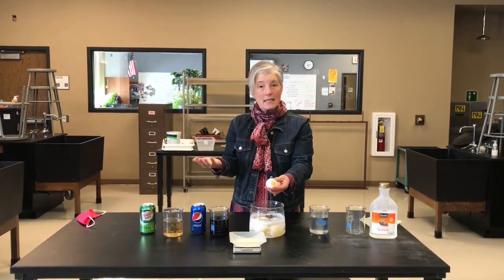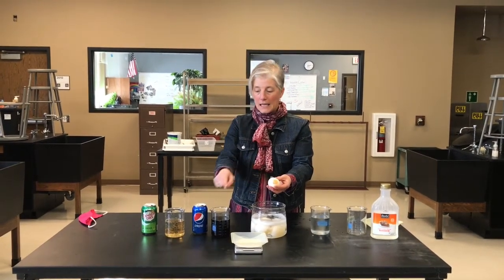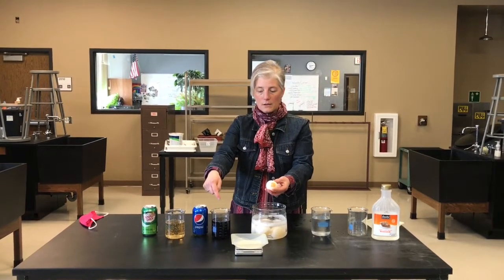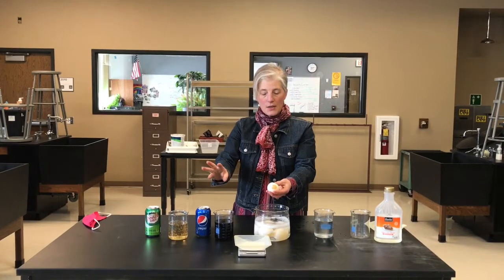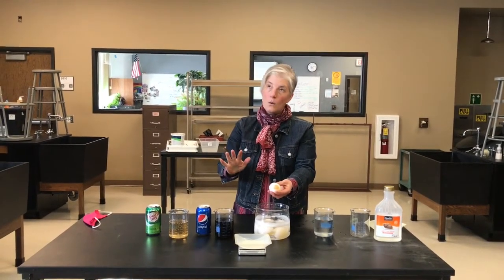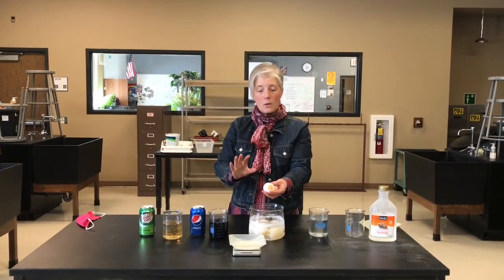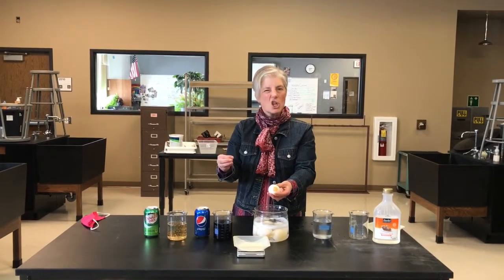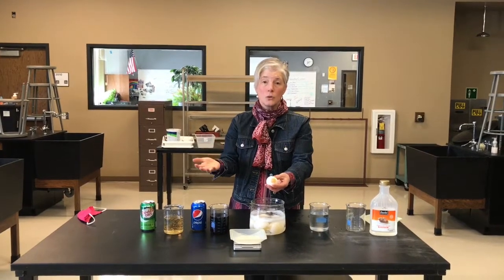So what we are going to ask today is, if we put these eggs into sugar, which way is the water going to go? Water go into the egg, water go out of the egg? Now I want you to think, water always moves to where there's less water. Or you can think about it, osmosis, water moving: water will always move to a higher concentration of stuff like salt or sugar, which the word for that is called solute.